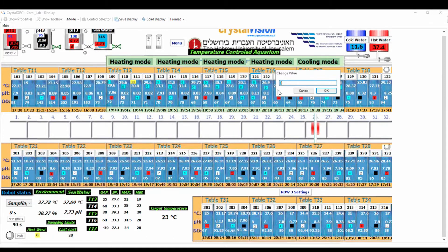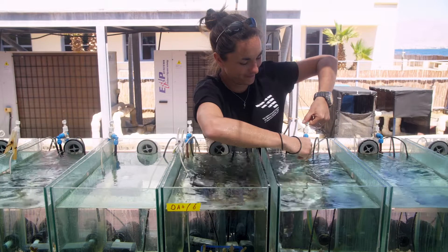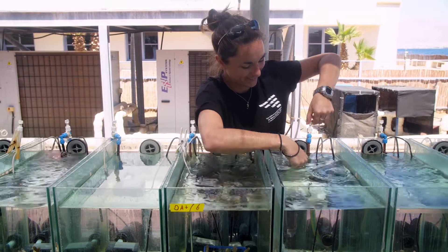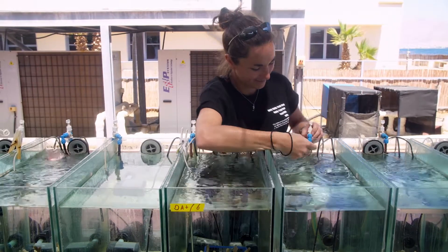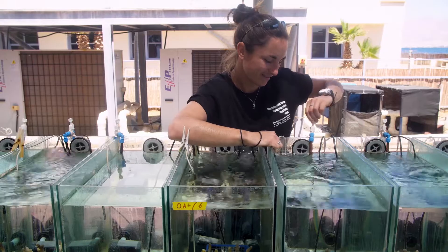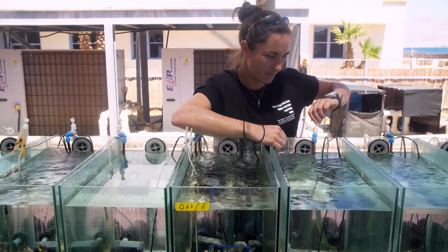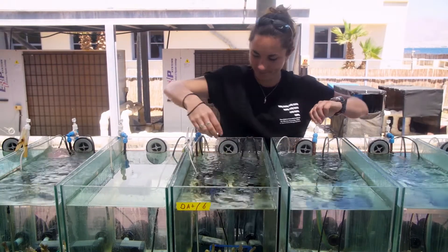Temperature is typically set at a delta from the incoming reef seawater in order to maintain the diurnal variability. Light intensities, spectra, nutrients, feeding and flow are also all easily manipulated on an individual aquaria level.